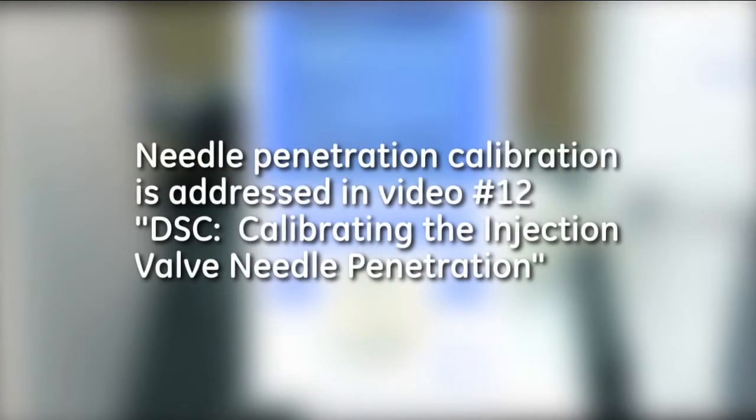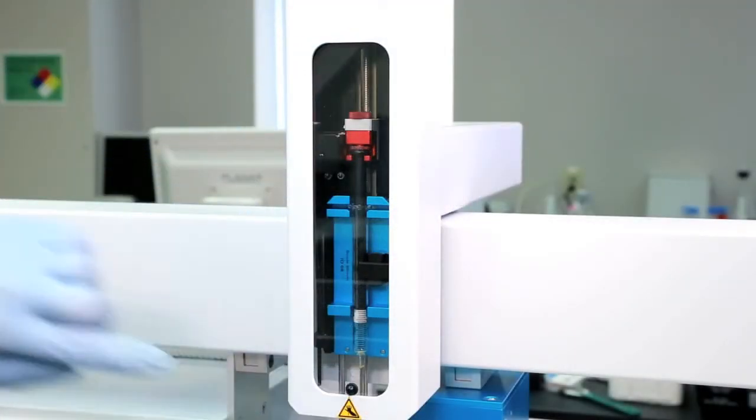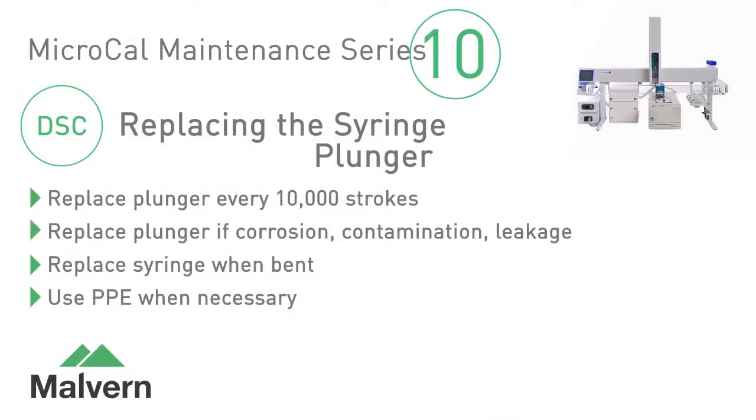Please note, after replacing a syringe, always check the needle penetration in the valve and make sure you lower the screen after this is completed.